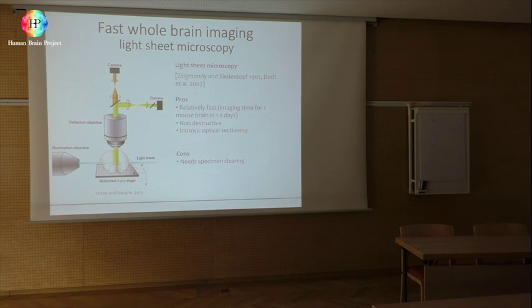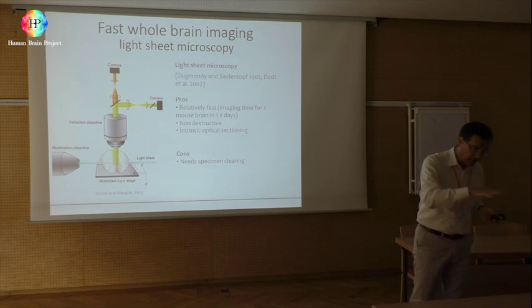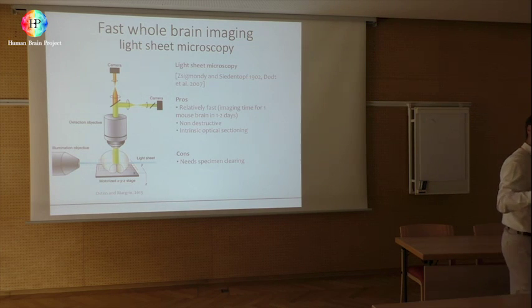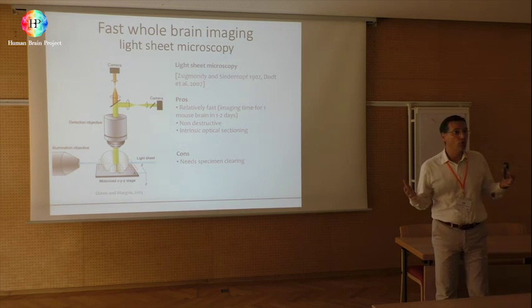But on the other side, the approach could be to use all the techniques together, using electron microscopy when you want to zoom in on some areas you are interested in, and using serial 2-photon microscopy to have a much larger volume with high-sensitivity multicolor. But to image the whole hippocampus, for example, it can take 24 hours or even more.